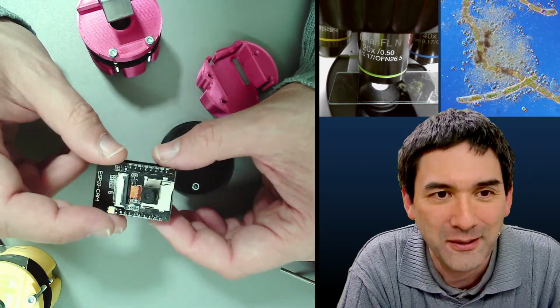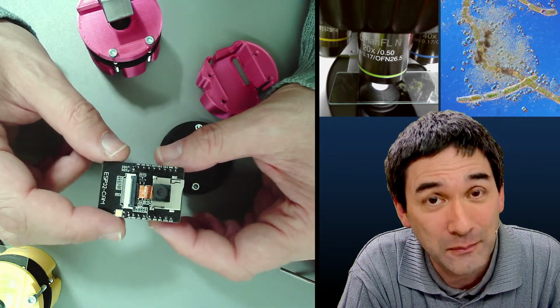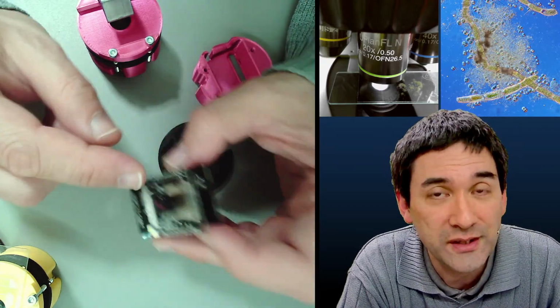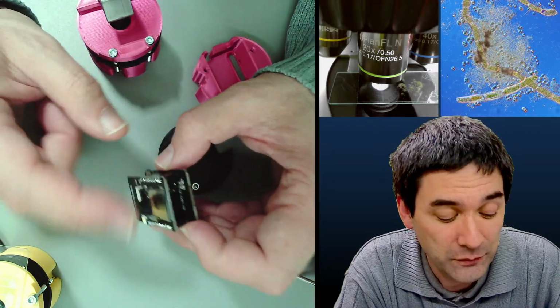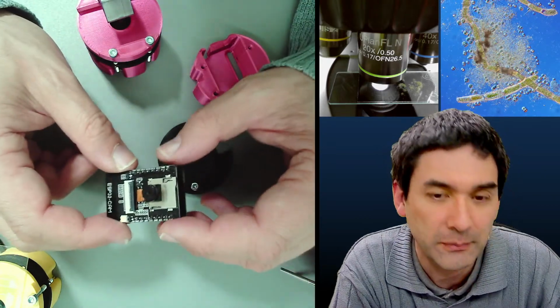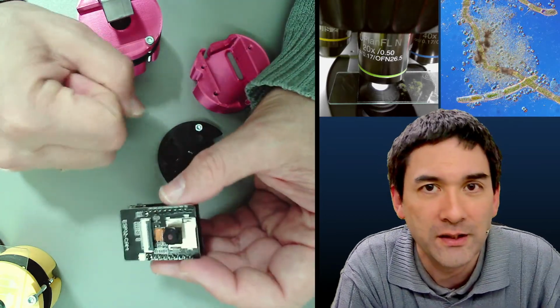And what projects do I already have in mind? Obviously, why not try to 3D print or make something where you can use this camera also as a camera for the regular microscope. For example, if you construct yourself a little case, I've been experimenting a little with 3D printing, you can attach it to the eyepiece, and then you have a wireless transmission.